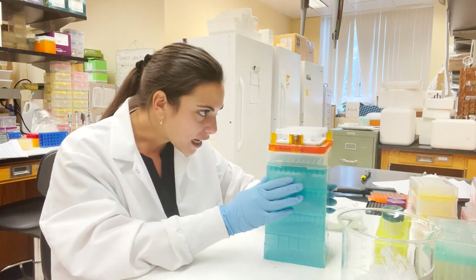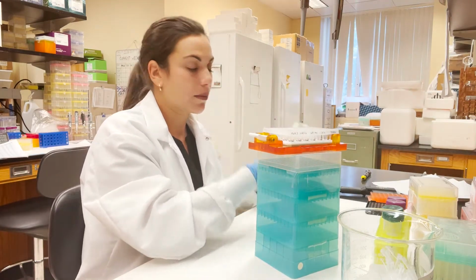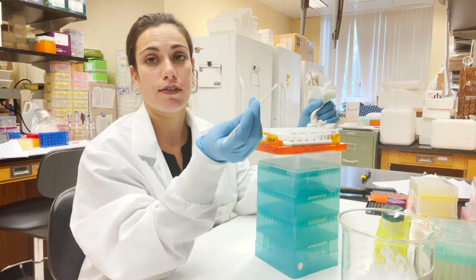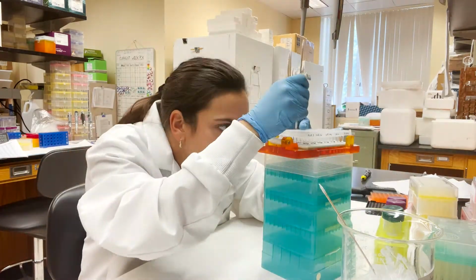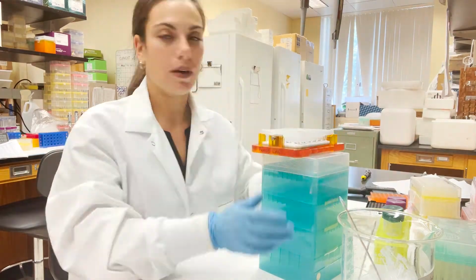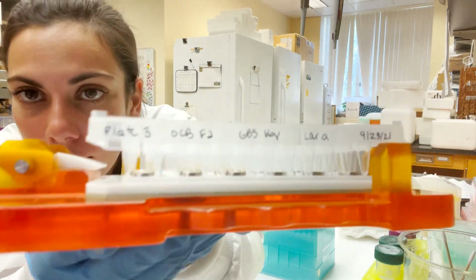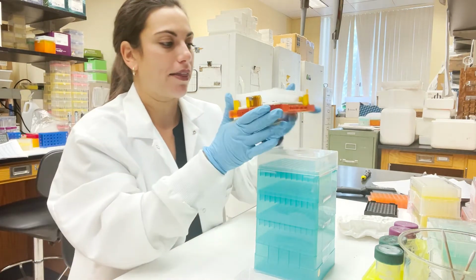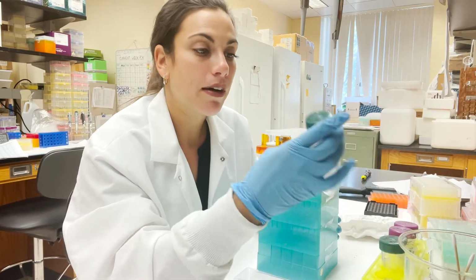We put it in the fume hood as well to kind of speed up the process and add a little bit of extra aeration. Okay, taking a look at our plate after 10 minutes. It looks like there's still a few wet spots. So I'm gonna go in with the cotton swabs and remove them, being careful not to touch them because they are sterile. So now they look pretty dry. I don't know if you can see in the video, but they look like they're cracking a little bit at the bottom. And there's no droplets of ethanol along the edges. So we can go ahead and now dissolve them in what we call EB buffer by QIAGEN.